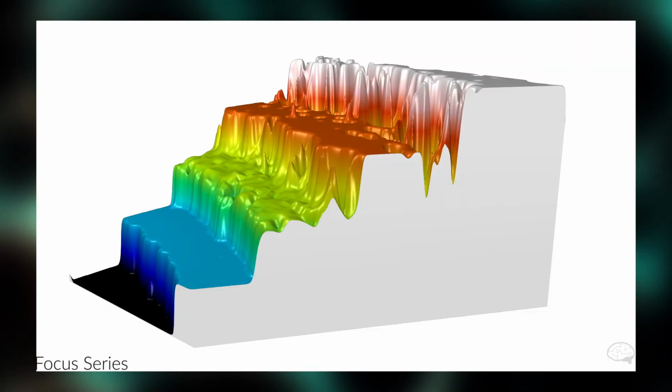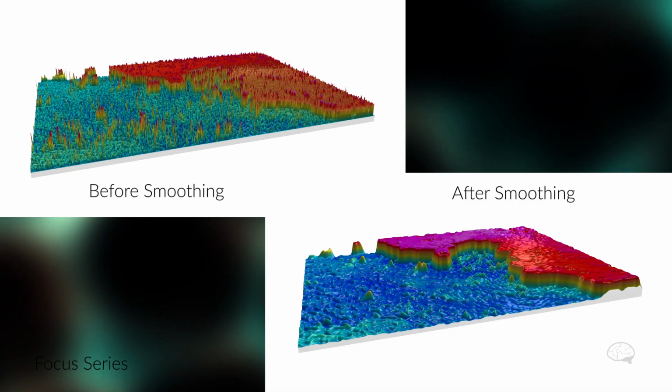Now, the reason this image collection might take a while is because you want the smallest change in focus you can get between the images. So to get a really nice surface, you might need to take 50 to 100 images. So why wouldn't it be smooth if I took fewer images? Well, one image will be in focus at this point, but if your next image is in focus here, you won't get a smooth transition between the two, you'll instead get a step. The smaller the focus change is, the smaller the steps are, and the smoother the surface will be. This brings up the other major drawback with this method, which is that it will likely need to be washed through some smoothing filters to minimize the steps in the reconstruction. But due to the high level of Z accuracy, I think that this method shows a lot of promise. It just requires microscope manufacturers to put a little development into the automation.